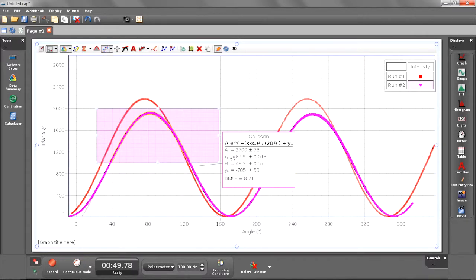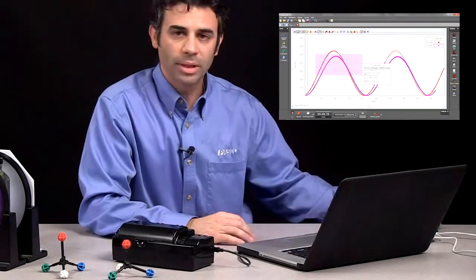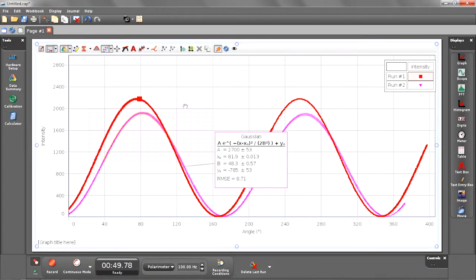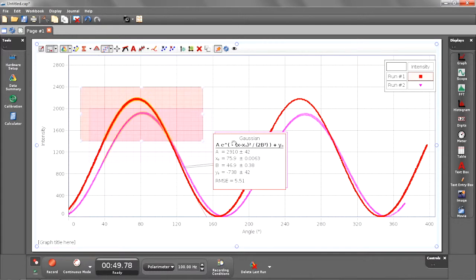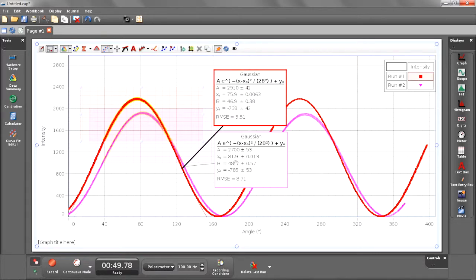And this x0 is my angle at the highest intensity for that particular set of data. Now I'm going to do the same thing with my first run, which was the blank, which was water. I'm going to highlight some data. I'm going to turn on my fit again.